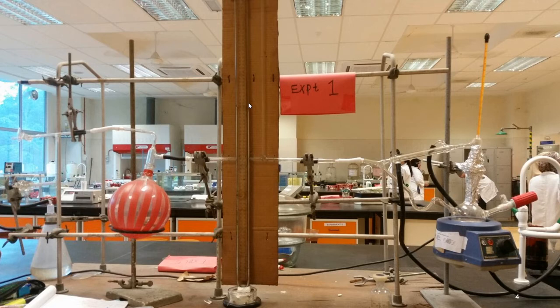The experiment involves changing the pressure of the system. Remember that PV equals nRT. If you increase the pressure, you're also increasing the boiling point.